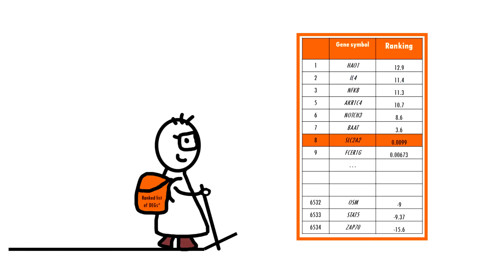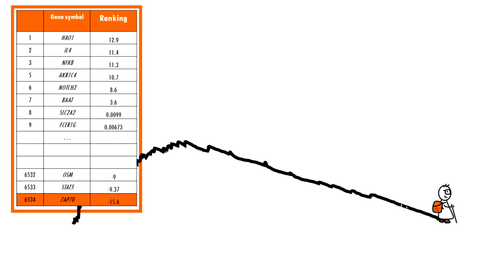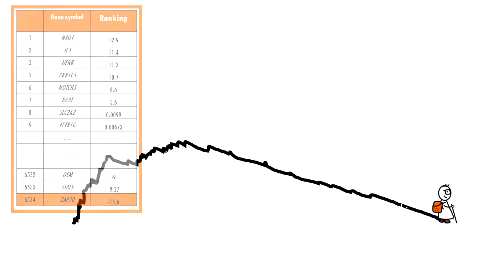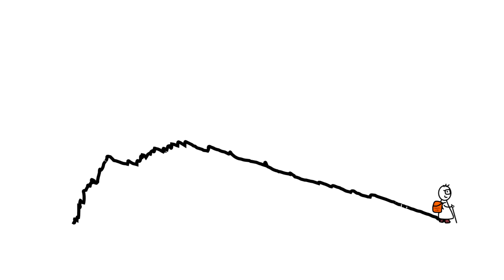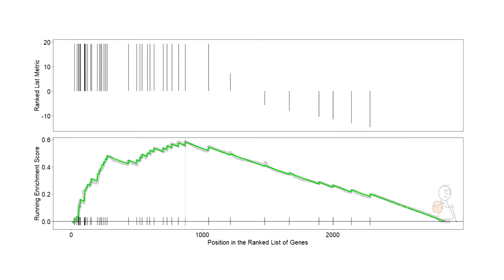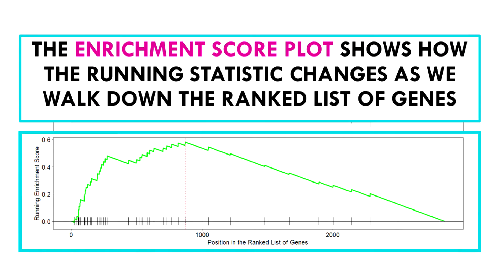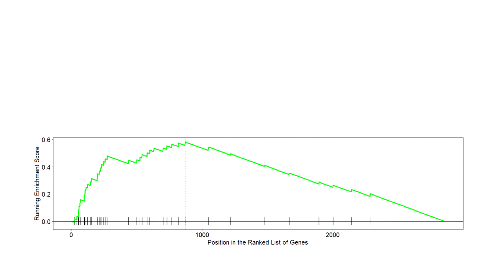Genes with larger positive or negative fold changes will result in larger increases or decreases than genes with lower ranking. Once we reach the last gene in our gene list we have the results for that specific pathway — it's basically our enrichment score plot. The enrichment score plot shows how this running statistic changes as we walk down the ranked list, and what's important is the maximum altitude you reached — that is the enrichment score or ES.